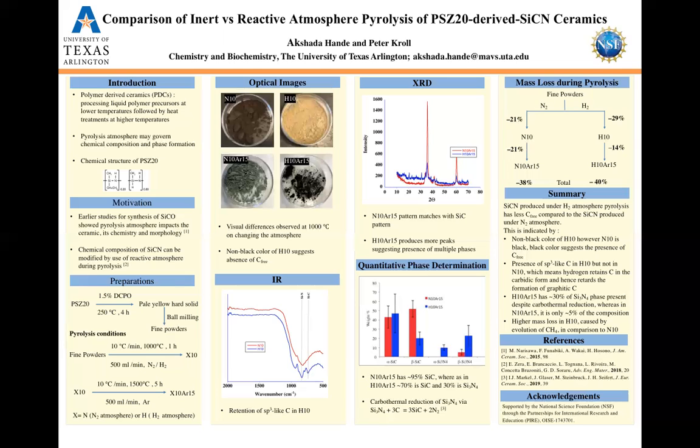The ceramic pyrolyzed under nitrogen, which has the red spectra, matches with the XRD pattern of SiC, whereas the blue spectra, which was for the ceramic pyrolyzed under hydrogen, has more peaks, which suggests the presence of multiple phases.